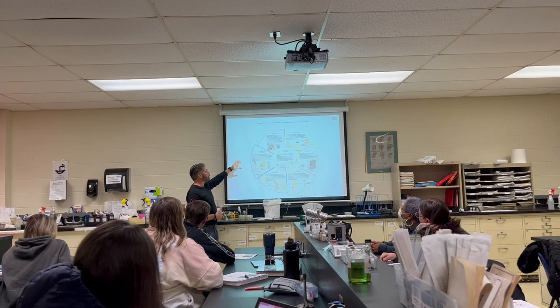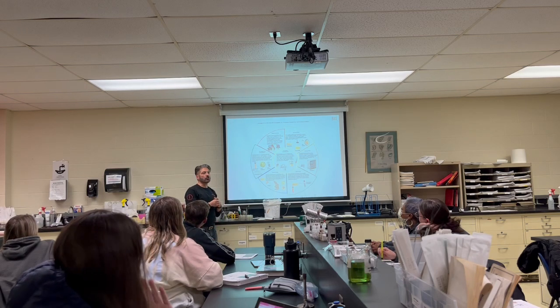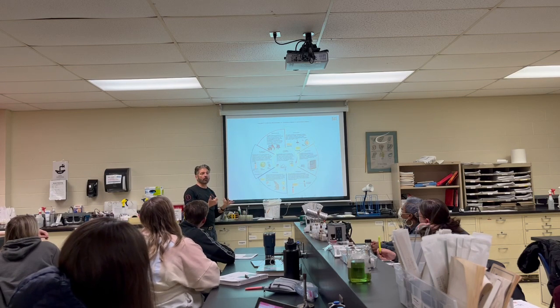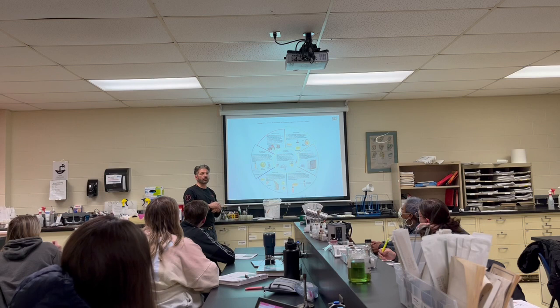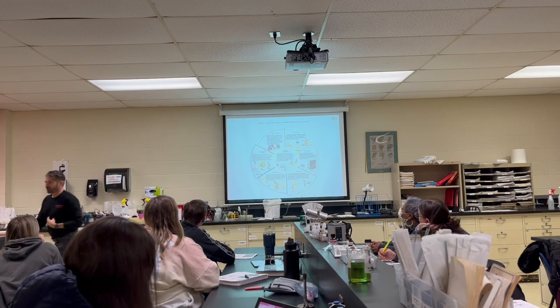Right? I'm playing with the idea of doing a urine lab in here. I'll take some different vials and I'll put different bacteria in it and some fun stuff. It'll all be fake. And then it'll be an unknown, and then you can grab it, you can stain it and tell me gram-positive, gram-negative, rod, what is it, E. coli, Klebsiella, Enterobacteriaceae, or something like that. So we'll kind of make it sort of real life-ish if possible.